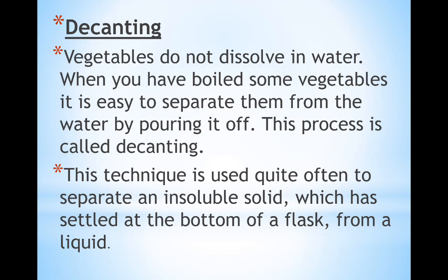Another example is when we wash the rice. So, we do decanting. This technique is used quite often to separate an insoluble solid which has settled at the bottom of a flask from a liquid.